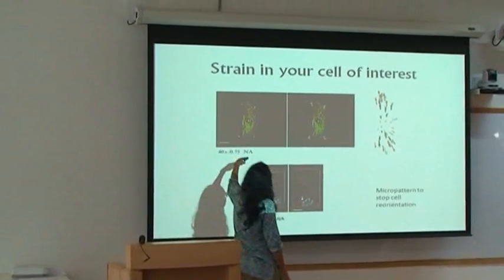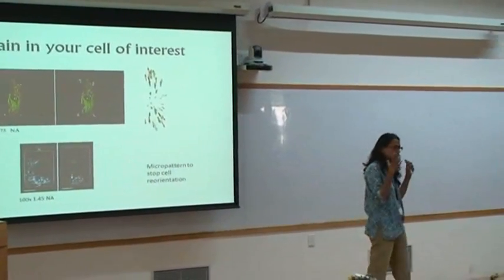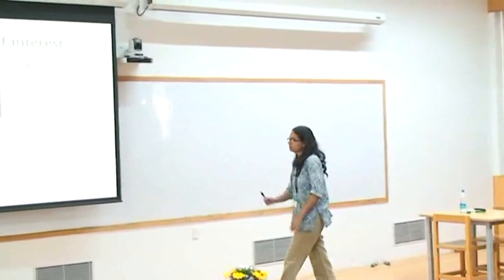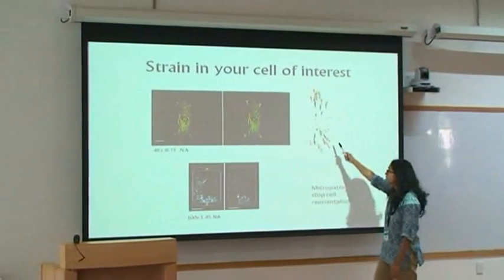This is the in situ skeleton, and when you just take a look at that, it doesn't look like the cell is stretched, right? I don't think it's stretched. We want to see something really stretched, and that is, I can tell you, much beyond the 10 or 20% strain that we're talking about. This is 14% strain, and you would hardly be comfortable calling it strain.